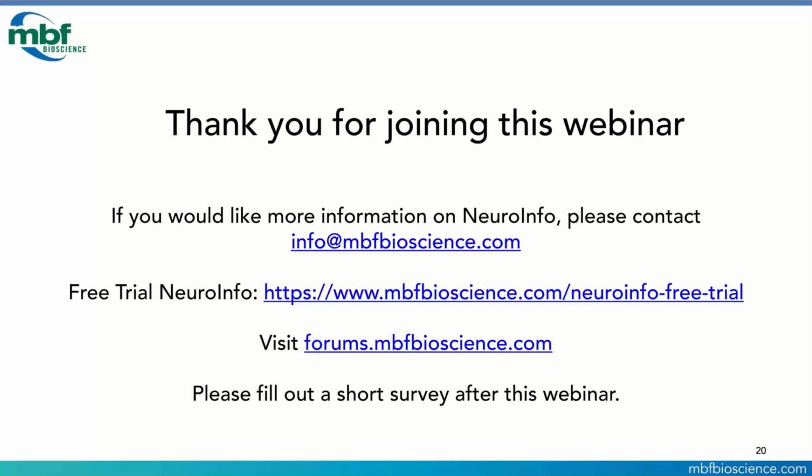Right, and that's one of the things we found. The reason it was so easy, and the first one we grabbed was the Allen, is because they actually have an API and everything is published and really well formatted. And so we worked with them to come up with a way to get that integrated into our software. But it was basically just grabbing some volumes, their ontology and their regions, the segmented regions that Chip showed, and putting those in our software.